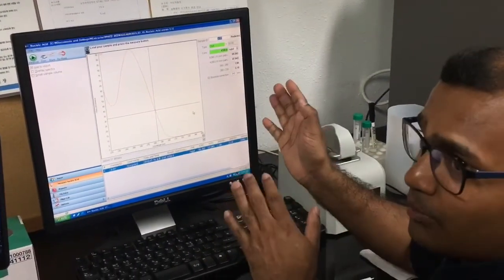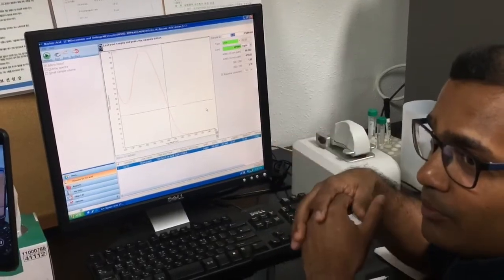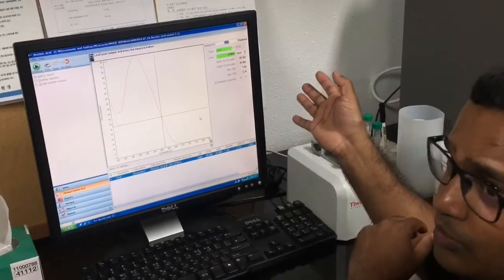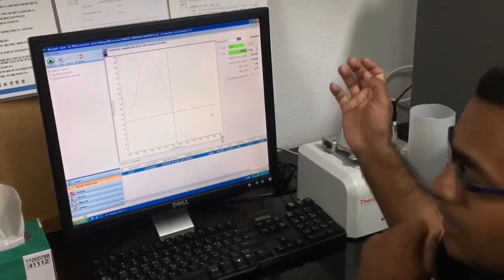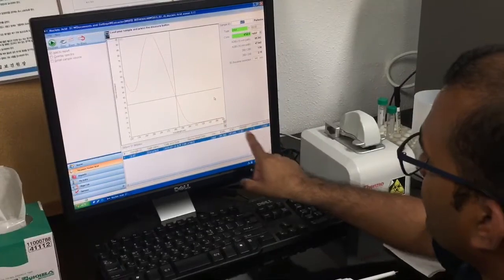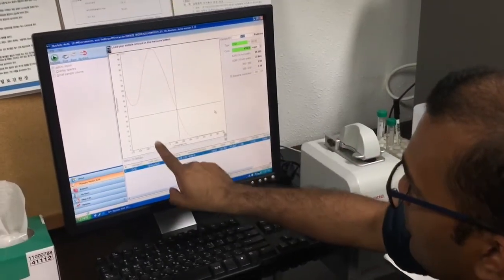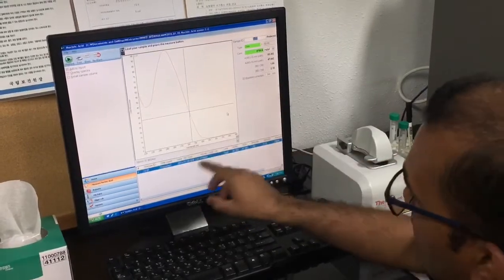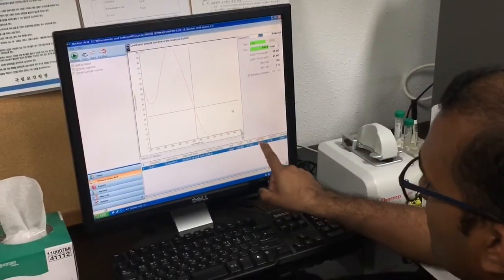Right, still good, but we also guess something other than DNA may be included, because it's close to 2, and 2 is something like RNA, right? Then you can see the shape of the graph is very good, right? But still the problem is this amount.